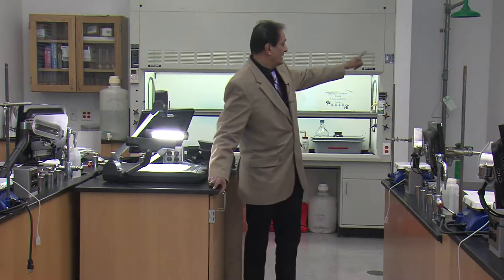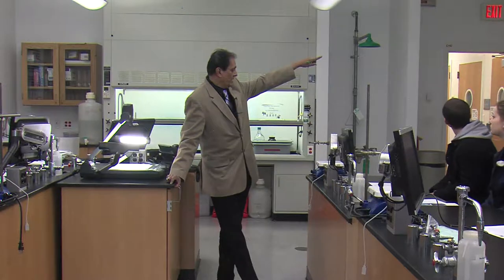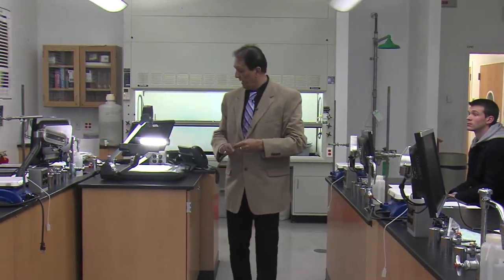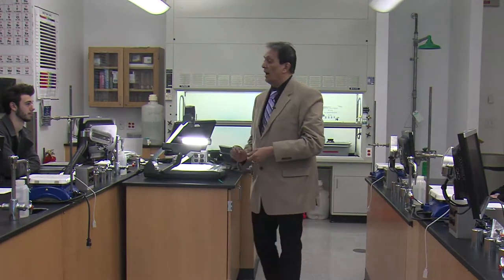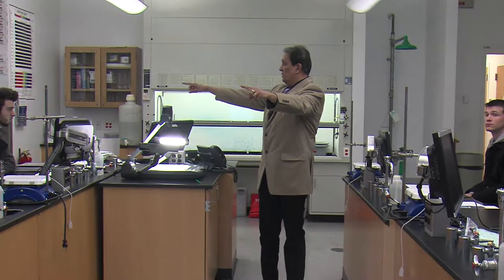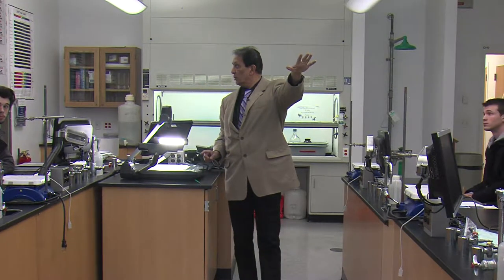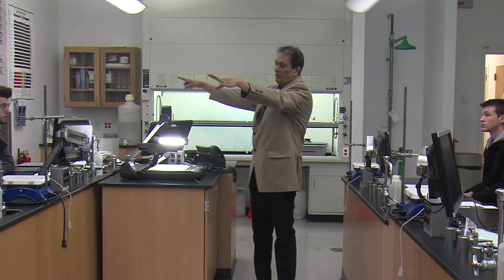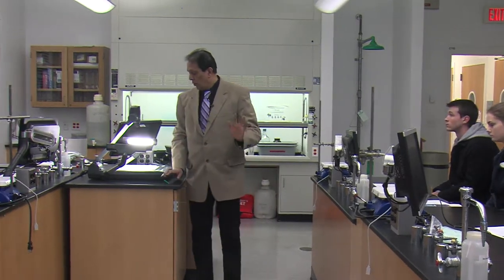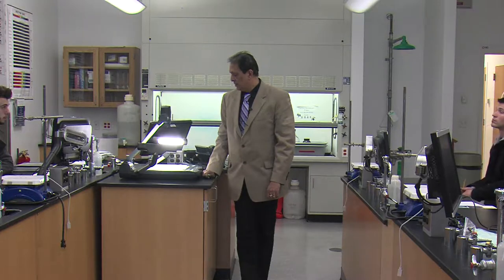This is the only exit that we have, okay? In case of an emergency, this alarm will ring. All right, might cause you temporary hearing impairment for a while, for the next 4 hours, I guess. We get out of this exit, all right? Never use these doors over here or that window, all right? That window is sealed shut, so don't even try to open it. These doors lead you back into the building. This is the only door that will lead you out. Go out, stay out until Manchester Fire Department tells you to come in.